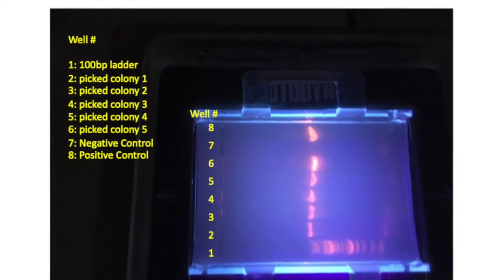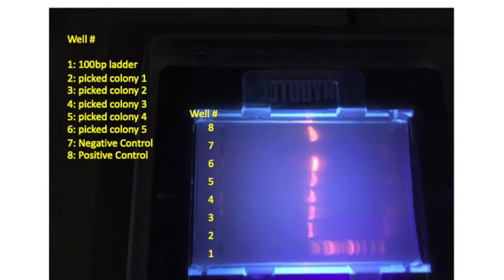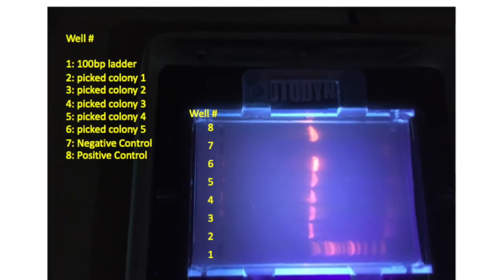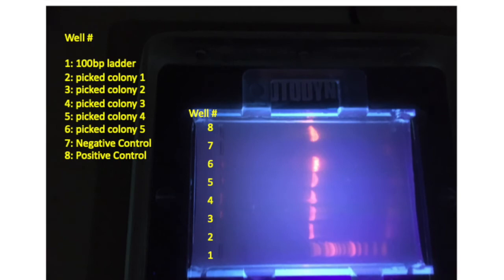Lanes 7 and 8 on this gel are a negative control and a positive control respectively. And you can see that all of the five picked colony samples yielded very good amplification. So all five of those samples could be sent for Sanger sequencing.